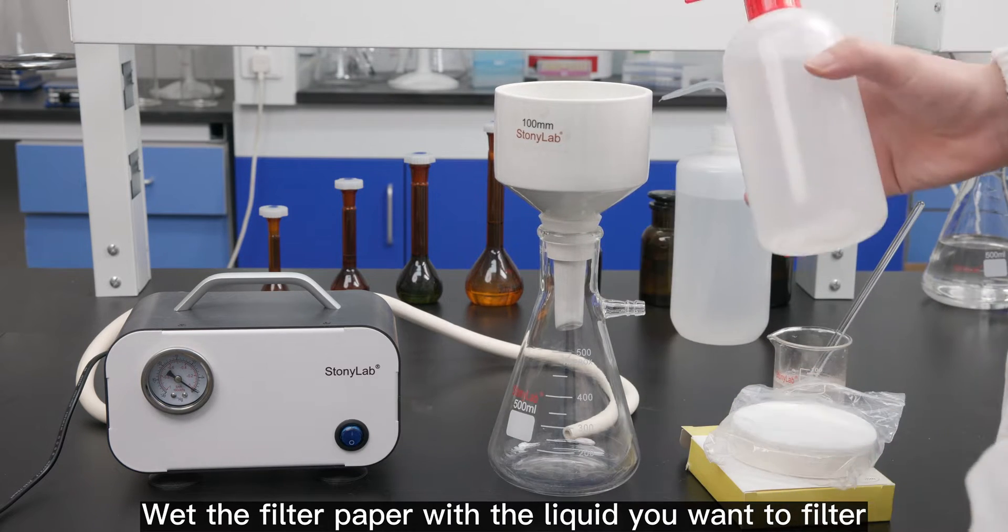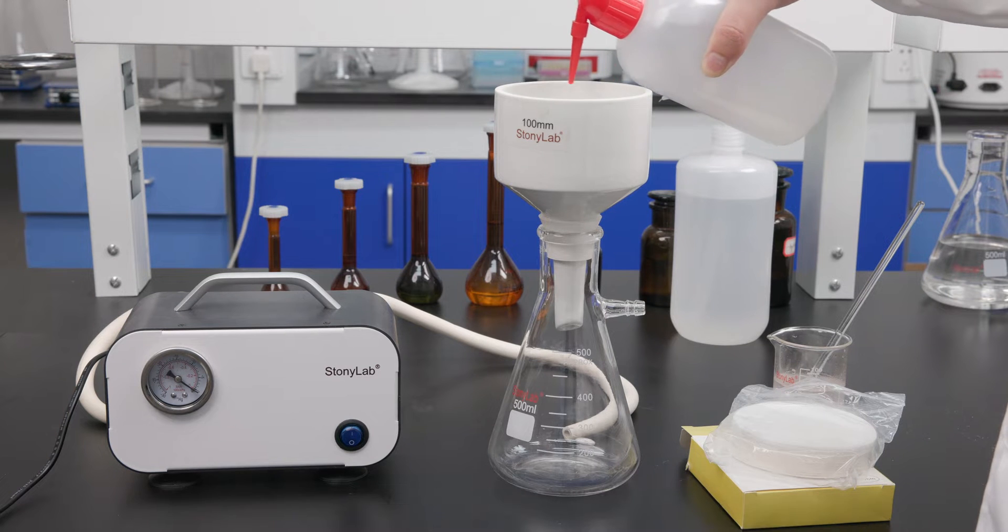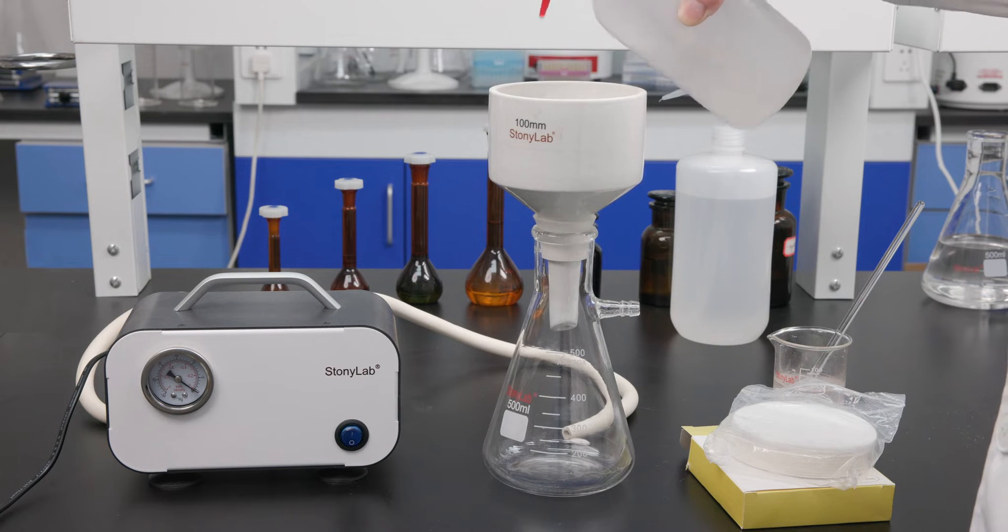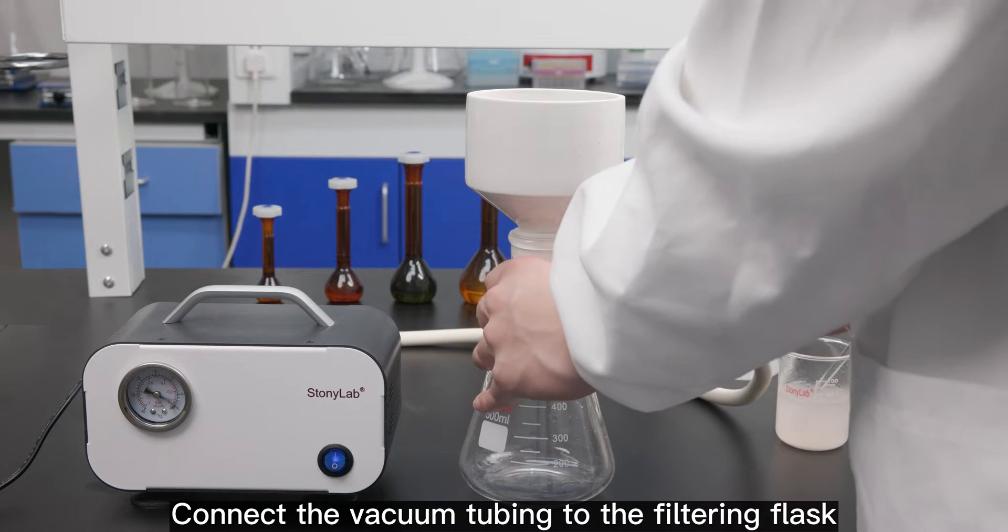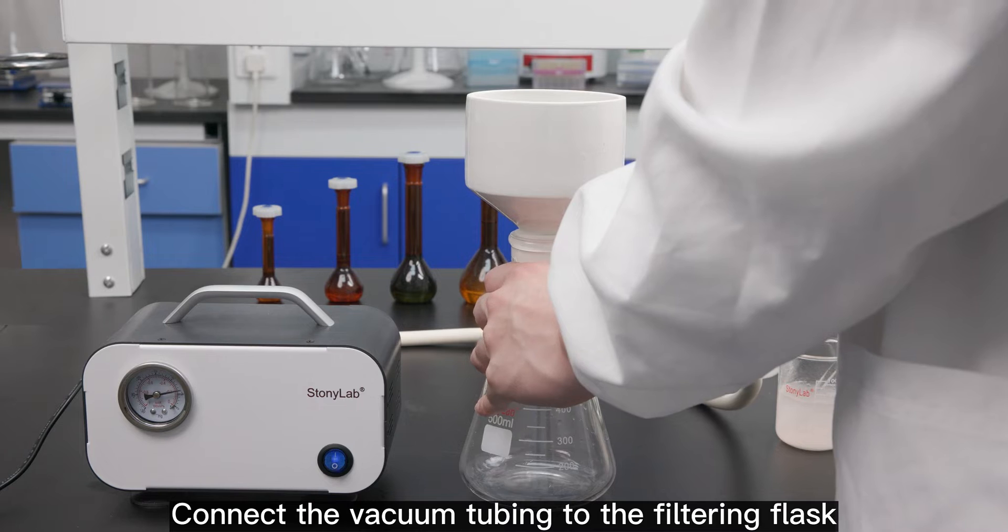Wet the filter paper with the liquid you want to filter. Turn on the vacuum pump. Connect the vacuum tubing to the filtering flask.